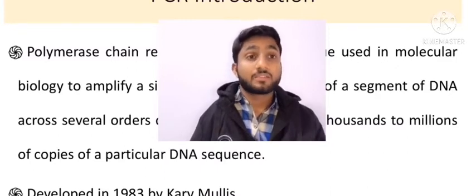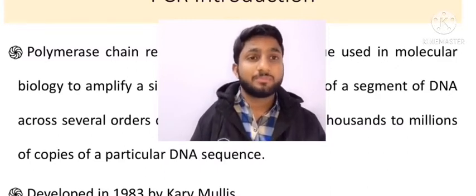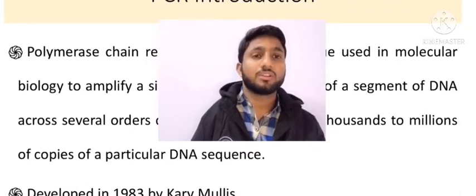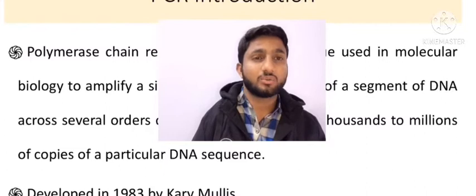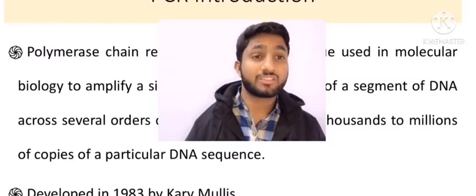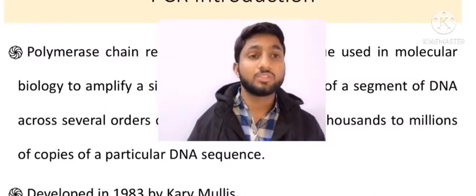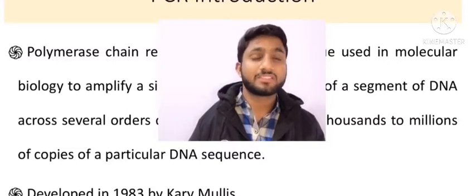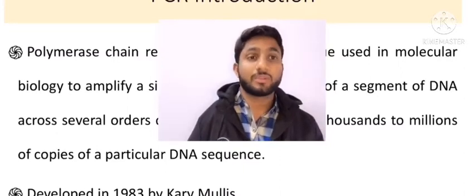Once you have extracted the DNA, you go for quantification of the DNA and assess the exact quantity of DNA in your sample. You usually use gel electrophoresis, or gel doc, for the estimation of the exact quantity of DNA in your samples.